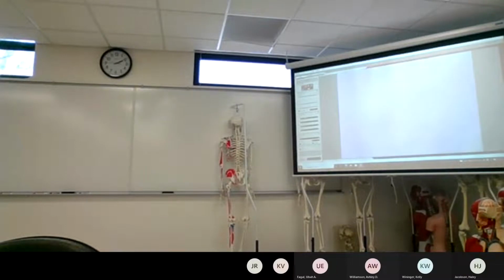You can see that these are a lot more, there's not much open space. These ones are kind of all touching. You can go between the two if you like.